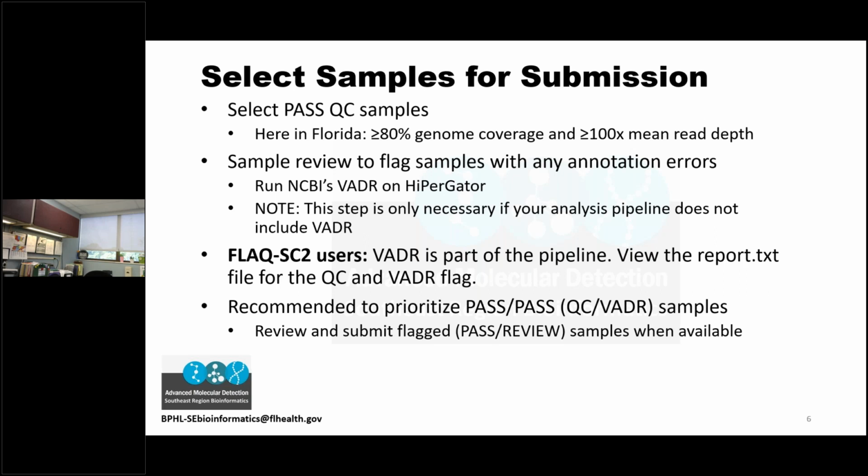And they've added different features to indicate, like on GISAID, they're called confirmation options, which I'll be going over in the training tomorrow. I just wanted to make you aware of that, just because one database accepts one genome does not necessarily mean the other one will. But screening the samples yourself with GenBank's pipeline is a good start so that you're not wasting your time trying to remake FASTA files and figure out why something got rejected.